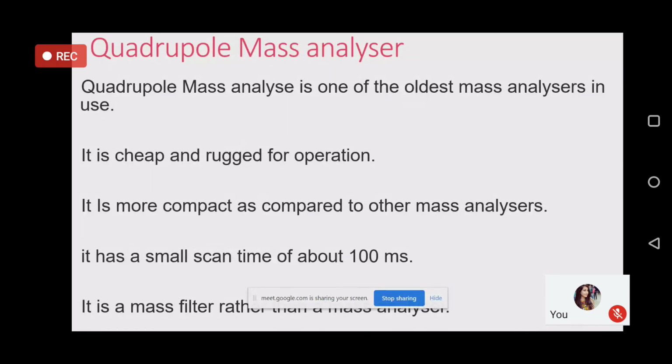The bunch width depends on the quality of the filter. It may be 10 nanometers, it may be 25 nanometers, it may be 30 nanometers, depending on the quality of the filter that you're using. But that basic we are not interested in here. What we are interested in is that when you use a filter, it is allowing only a particular set of wavelengths to pass through and destroying all other wavelengths which are reaching it. So what comes out of the filter is going to be a very narrow band of wavelengths, very close in value, with the width maybe 10 nanometers, 5 nanometers, depending on the quality of the filter. No other wavelengths will be available.